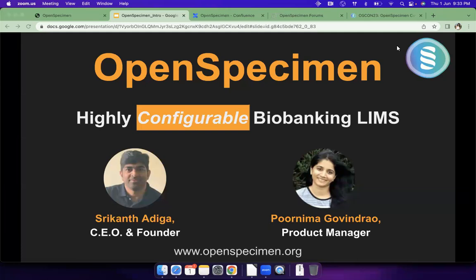Hello, everyone. I'm Purnima. I'm the product manager at Krishagni, and I have with me Shrikant Adiga, who is the CEO. So today we'll be giving you an introduction about OpenSpecimen, different features and capabilities. If you are interested in a specific one-on-one demo, we'll be happy to do it based on your use cases. So first we'll start with some introduction about us and about the product, but we'll spend most of the time showing you the actual features of OpenSpecimen.